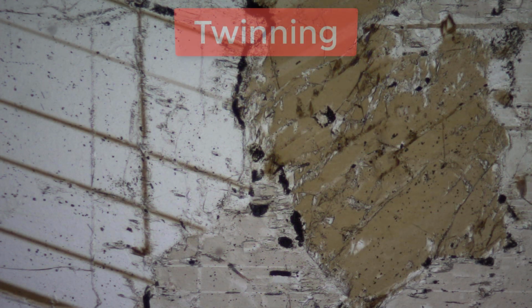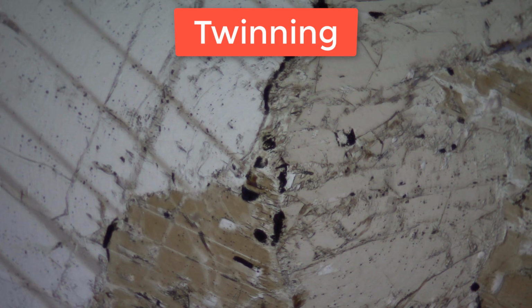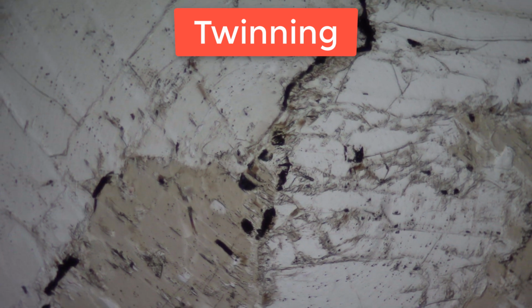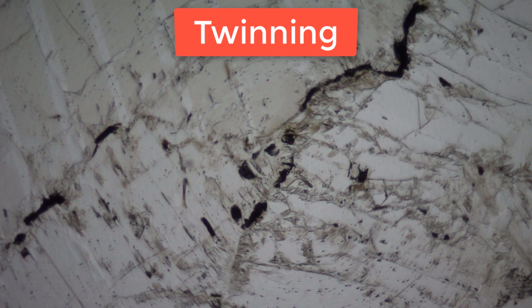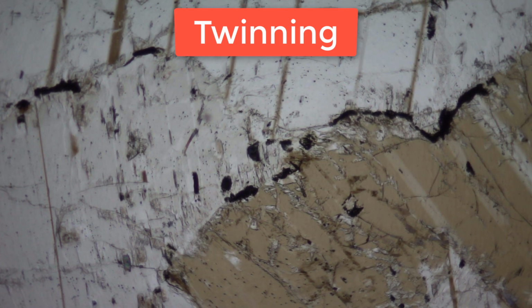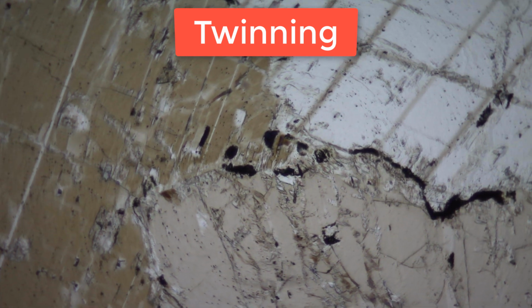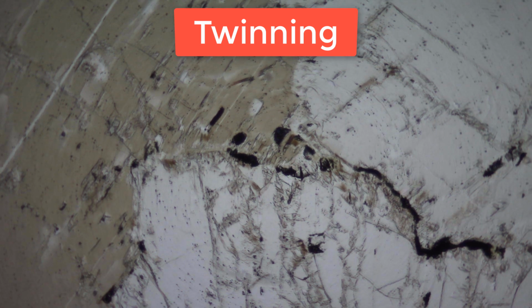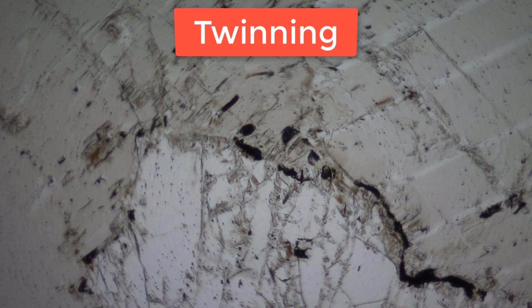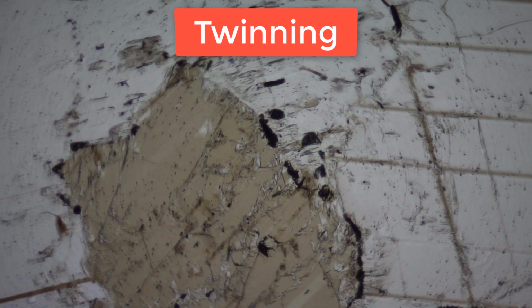Twinning occurs when adjacent crystals of the same mineral grow symmetrically and share some of the same crystal lattice. Twinning often appears as lighter and darker shades of the same color as one twin inclines toward or away from extinction. This creates a striped appearance and is the result of different crystallographic orientations of the twinned minerals.